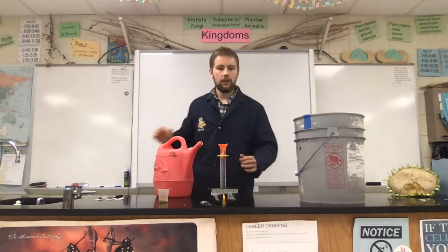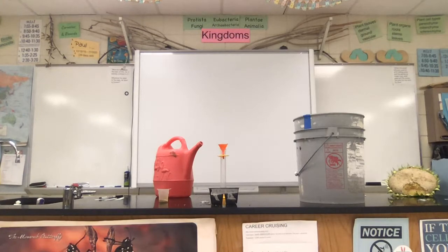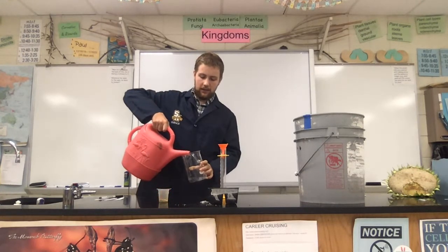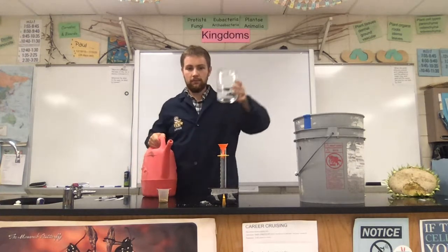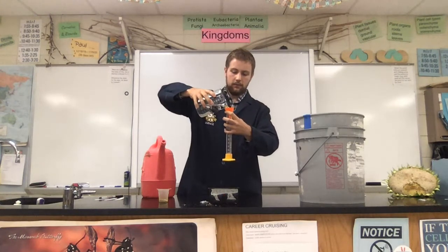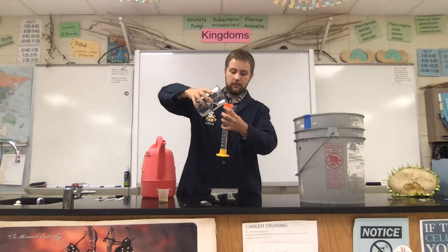But actually, I'm going to go get a beaker. I've got a handy dandy beaker here off screen. Nice 1,000 ml beaker. So let's go ahead and get some water. Let's get about that much. That's good. Now we're measuring out the water. Let's get 10 mils here. Oh, we got more than 10. I guess we'll do our 50 mils first.